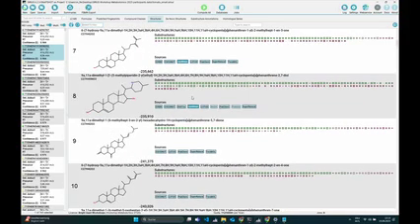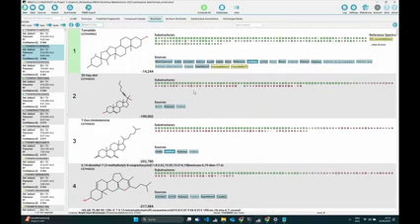The other thing you might want to look at is whether your top hit candidate has a large gap to the next candidate. This is already quite a good sign that this might be a good candidate. But to be honest, these are all features that are used by the confidence score. We basically built the confidence score for that. It checks: does the compound class fit, is the score difference high, and so on. So as a recommendation, don't look at the CSI FingerID score to check whether an annotation is correct. Look at the confidence score.